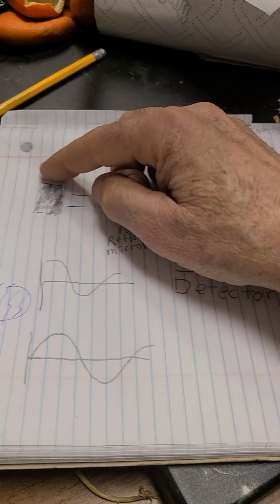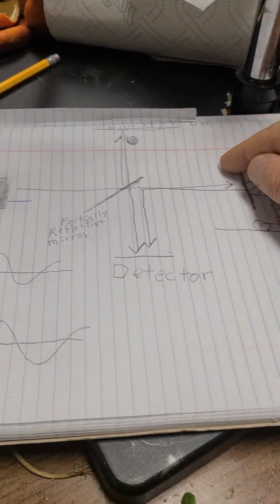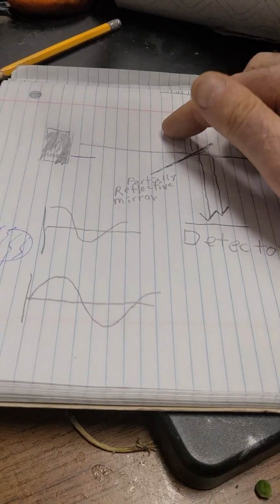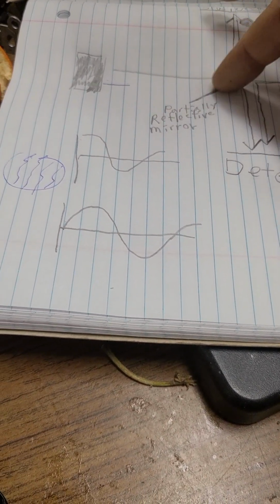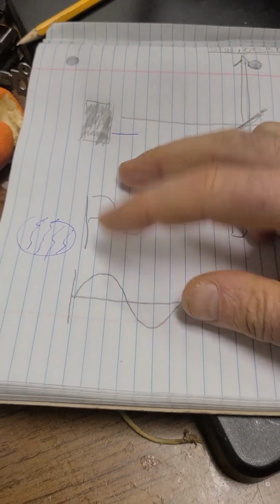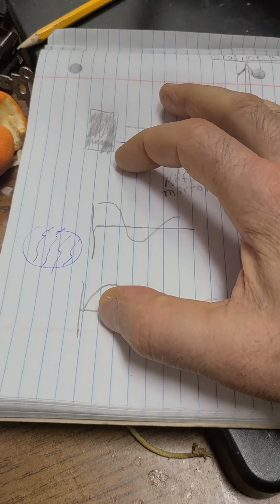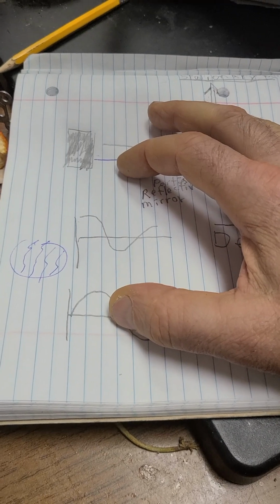The wiggle would be varied. Sometimes it would be bouncing rapidly, sometimes it would be slow. The slow, of course, corresponds to a lower note. So the notes of the light, if we think of it as notes in audio, okay, so two different spots, different graphs. And then what we're going to do is analyze each spot as a sum of different frequencies.